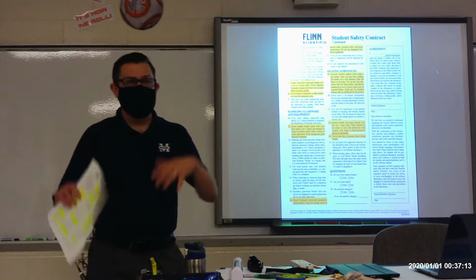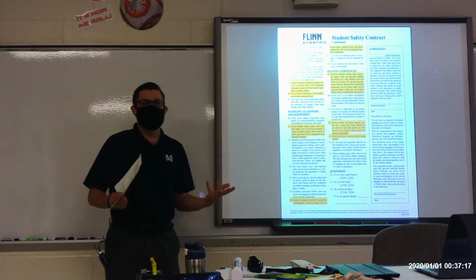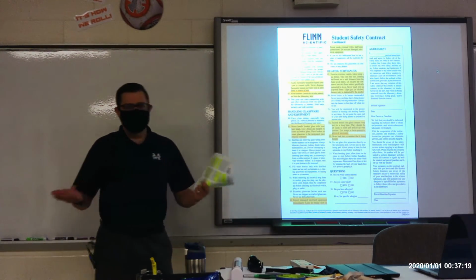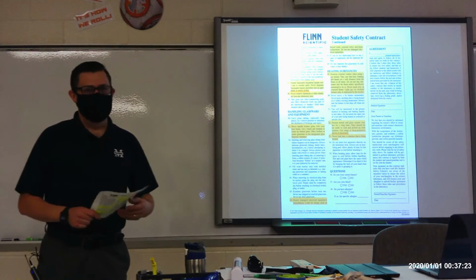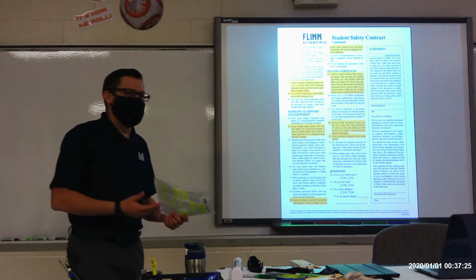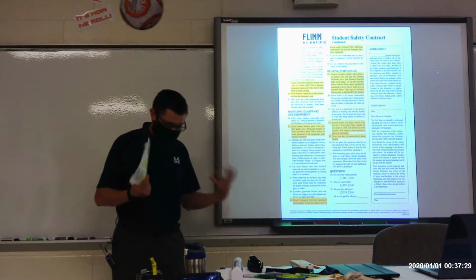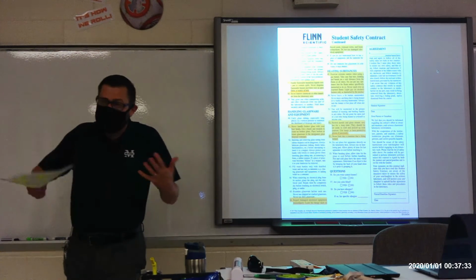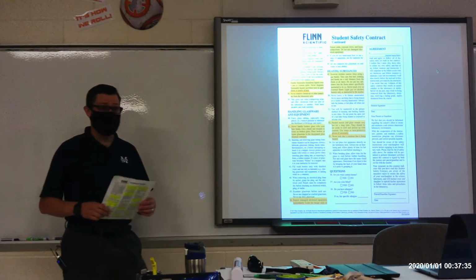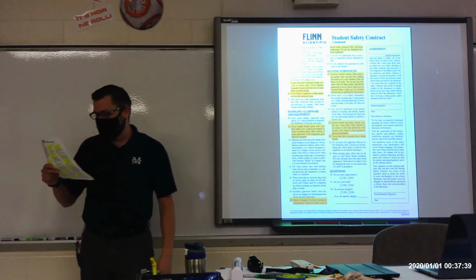So obviously, anytime we're dealing with heating something or fire, we need to be careful with that. Really, the only thing we'd be doing in here periodically is heating up water, and I just use the microwave for that. So we're not really going to be doing a whole lot with fire or hot plates or anything like that. But again, you never know. I might get creative. We might come up with a new lab that I've never done before, so the situation might arise.